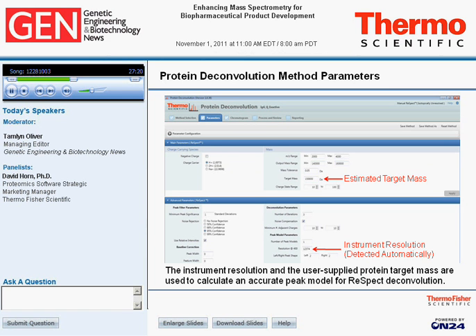So what we see here is the list of parameters. There are basic parameters up top, which are ones that users will change more often, and advanced parameters down below that pretty much you'd need to be an expert to really want to change. A couple of parameters you're probably used to by this point, for those of you who have done deconvolution: an input m/z range, an output mass range, a mass tolerance, charge carrier, and so forth.